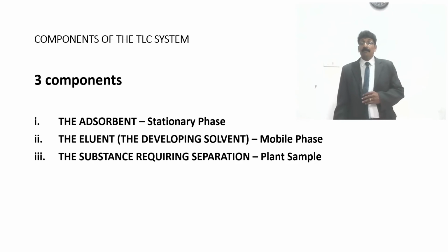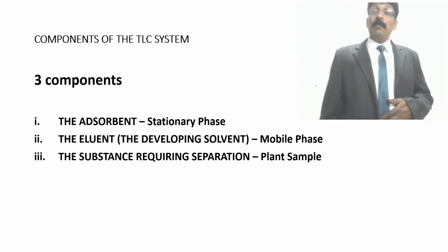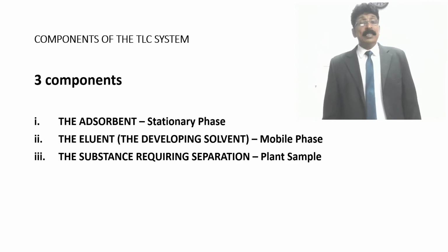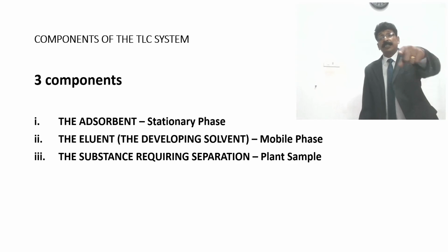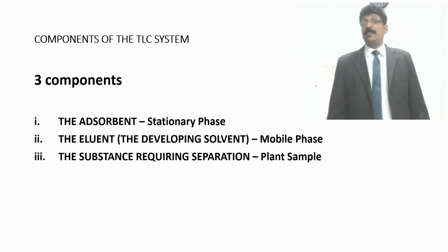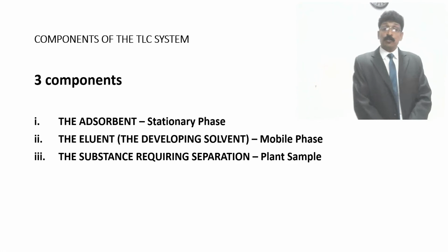or even in pharmaceutics, in the formulation and development technology, and also in the analysis. Quality control and quality assurance also play a major role for this TLC technique, or even thin layer chromatography by means of high performance thin layer chromatography. HPTLC is an advanced technology now. It is more useful in the pharmaceutical industry.